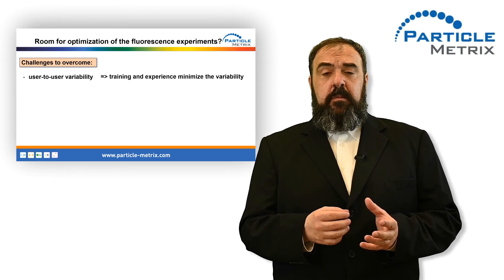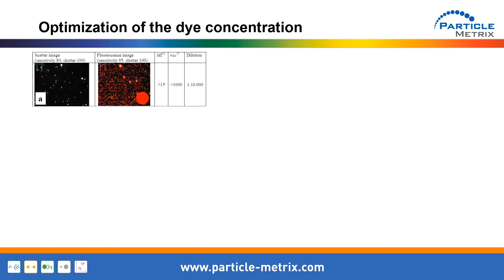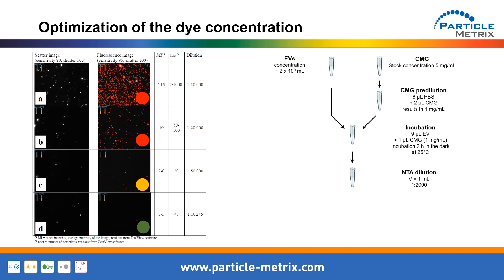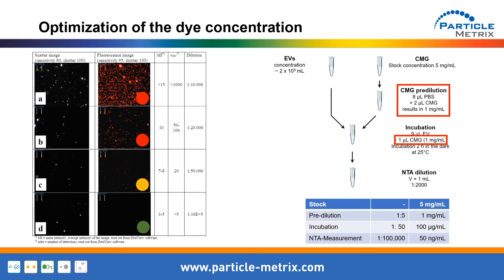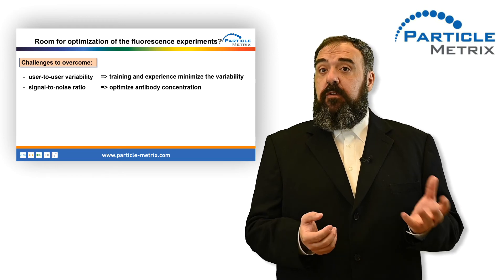The next challenge which needs to be overcome is the low signal-to-noise ratio of FNTA. Staining with fluorescence means adding dye in excess, which in turn means a high amount of unbound dye. It would be good to wash all the free dye away, but unfortunately we are working with very small particles, so washing is a problem — it would cost a lot of time and we would lose a big portion of our particles of interest. The solution is optimizing the dye concentration so that in the final dilution the concentration of the dye is below the detection limit of the detection system. In most cases, pre-dilution of the dye is highly recommended. In this example, the unspecific membrane stain Cell Mask Green requires a pre-dilution of 1 to 5. Optimizing the antibody concentration will help to optimize the signal-to-noise ratio and therefore lower the detection limit.